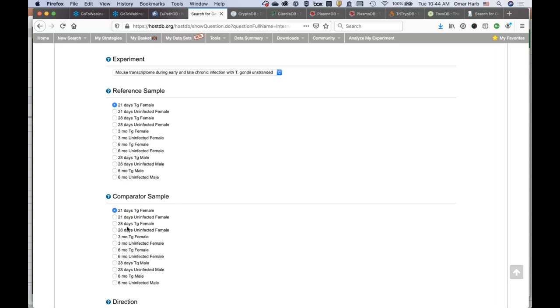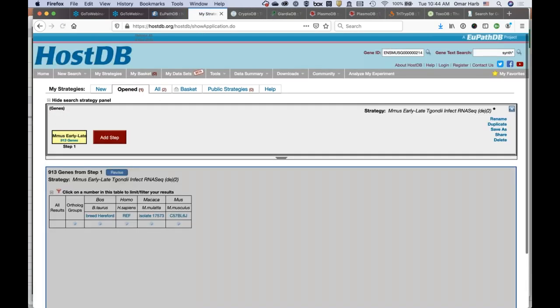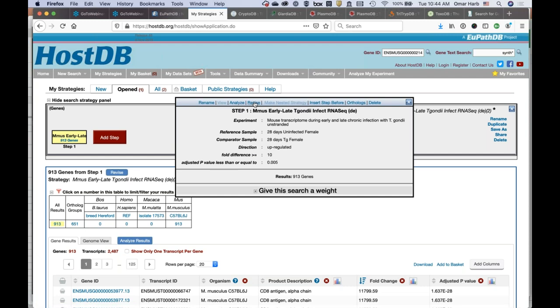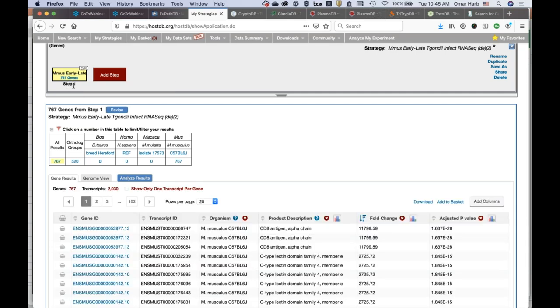The question is: is there a difference in gene expression between infected and uninfected hosts, and is there also a difference between male and female mouse responses? The comparator sample is the numerator and the reference is the denominator. I'll compare 28-day Toxoplasma-infected females to 28-day uninfected females, selecting upregulated genes, fold change of 10, and p-value of 0.005. If you get zero results or a number, you can always go back and revise the step. For example, changing to 15-fold reduces the number of genes in your result.